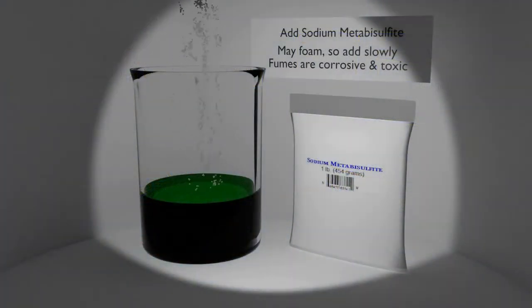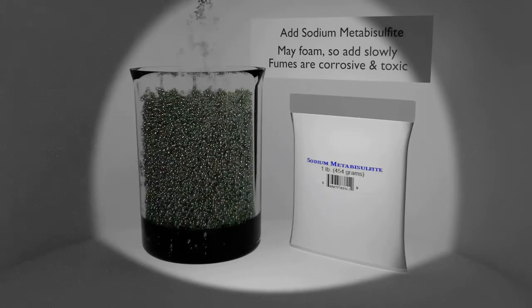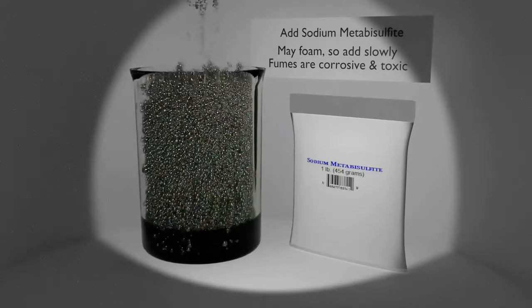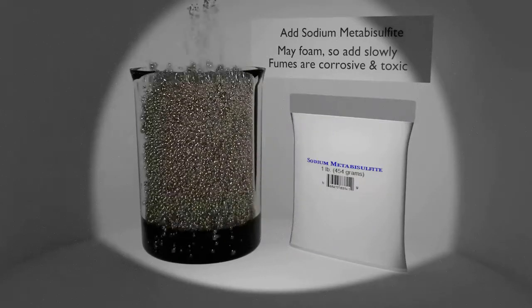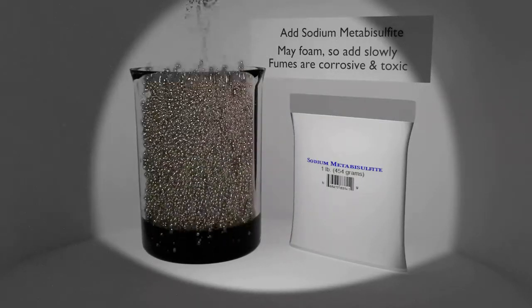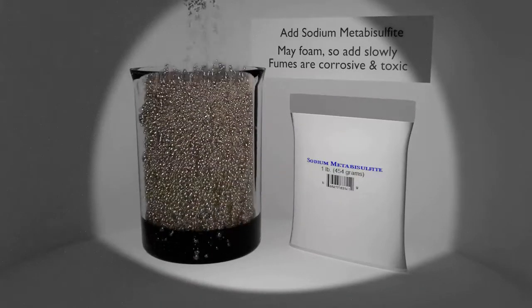Precipitation using sodium metabisulfite: do this inside of a bucket. Sodium metabisulfite has a tendency to foam out of its container, so add it slowly and do not heat the solution. Stay well away from the fumes. Typical precipitation time at room temperature is about 30 to 60 minutes.